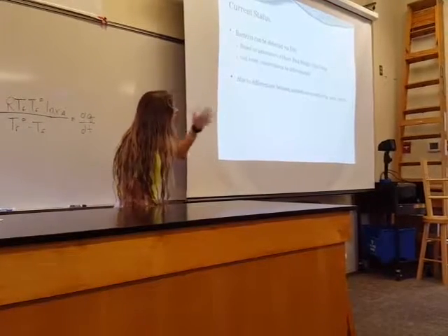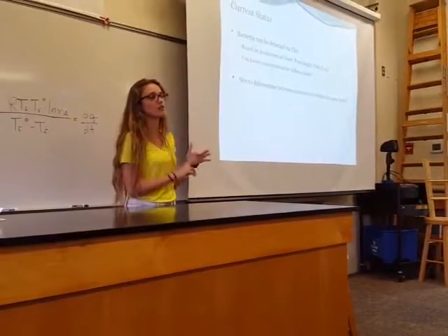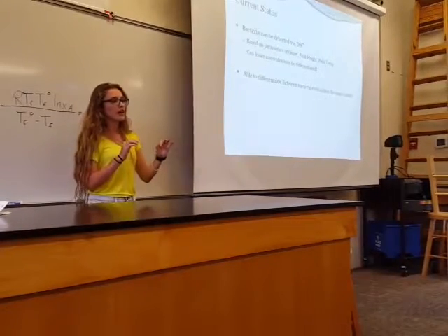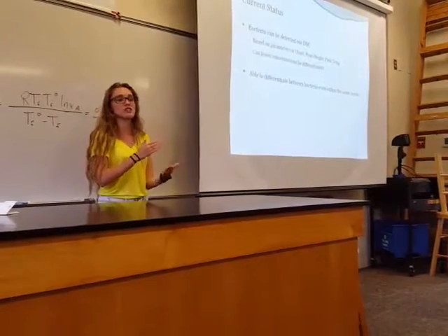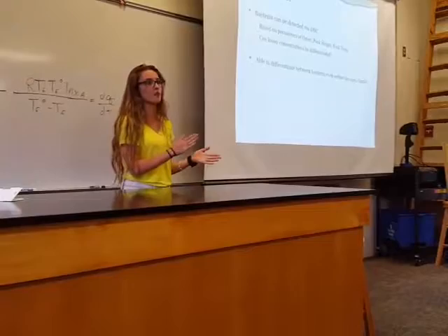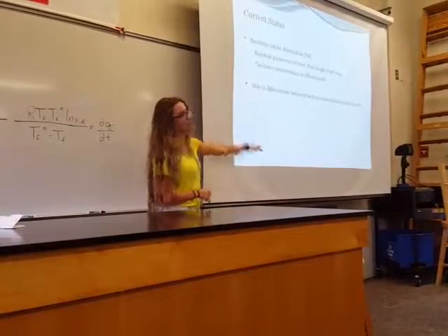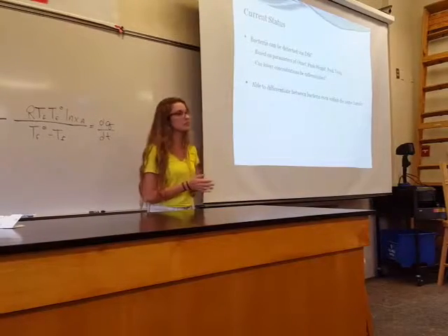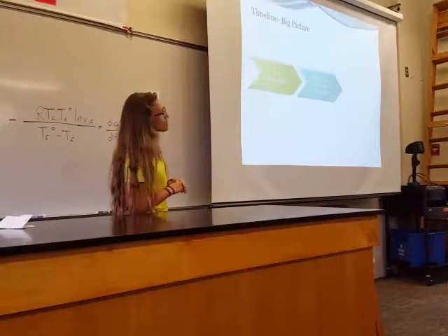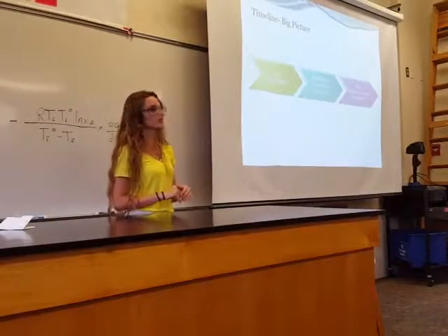So currently, we know that bacteria can be detected using the differential scanning calorimeter based on onset, peak height, and peak temperature. However, we don't know how low or how high the concentration needs to be in order for the bacteria to be determined, and so that would be something that could be done in the future. But another important point is that we are able to differentiate between bacteria even within the same family using the differential scanning calorimeter. So is it detectable? Yes. Are we able to tell the difference between bacteria? Yes. And what concentration is detectable would be the next step.